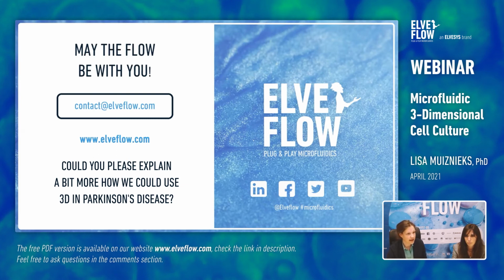So if you had cells that produce these therapeutic agents and you encapsulated them inside a particle that was, say, made of alginate or collagen or something to protect the cells, you could then use these particles loaded with cells that would produce therapeutic agent and implant them into the body. And I think this is a powerful tool and quite new, I think.